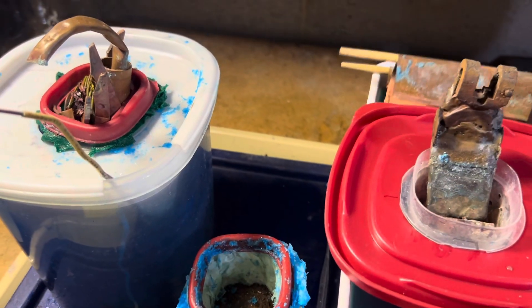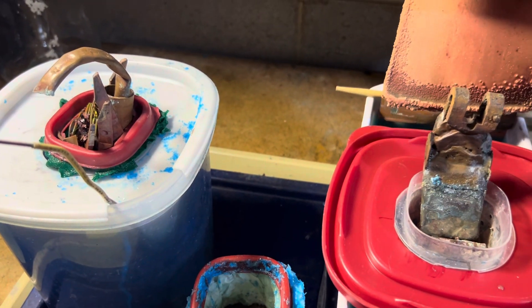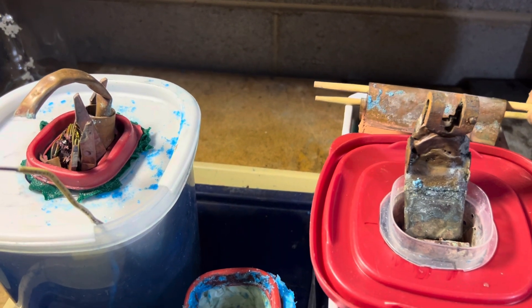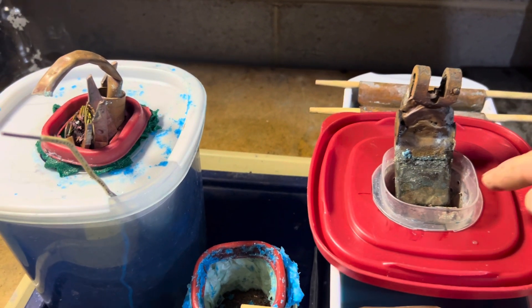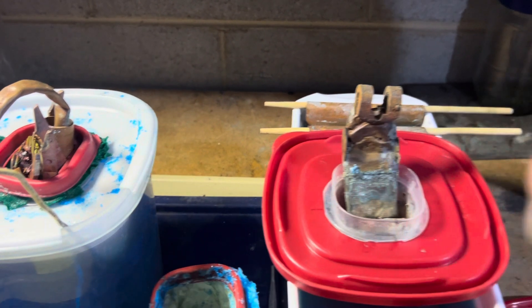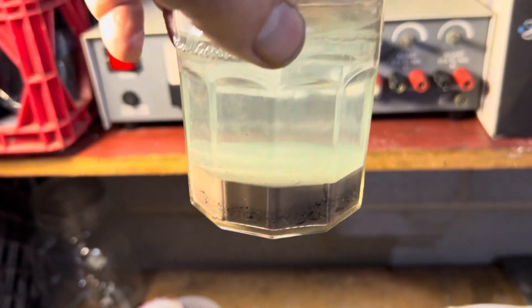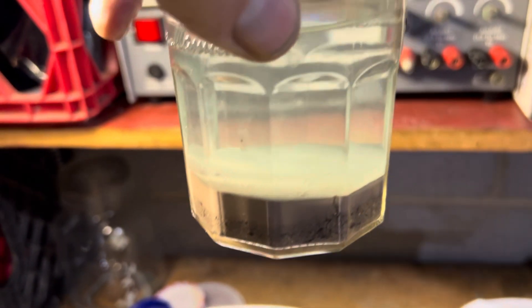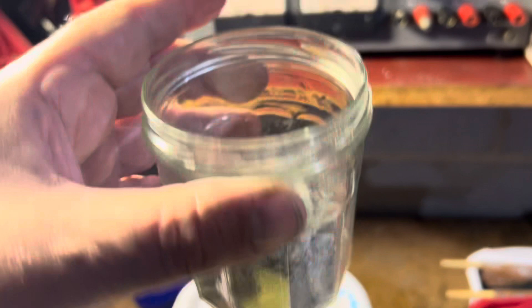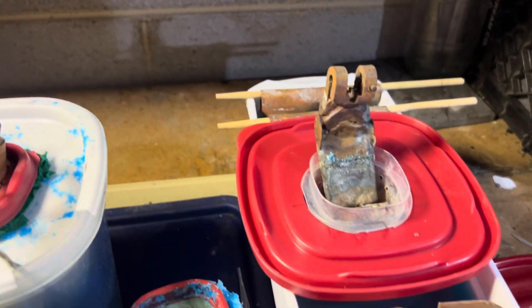The copper gets deposited on these cathodes here from the solution. We start off with silver plated objects here. The silver falls out as slimes and is recovered like this. It's a little dirty, but you clean it up and it will look like this later. That is silver that's been recovered from this here.